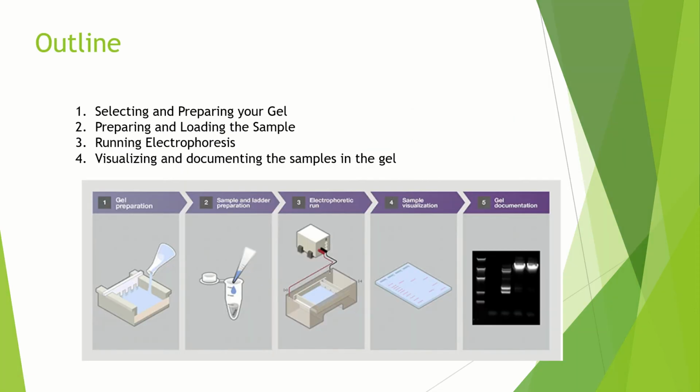In general, you need to select and prepare your gel, then prepare and load your sample, run the electrophoresis, and lastly, you can analyze your results as bands.